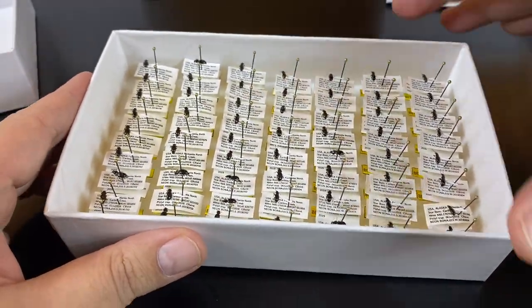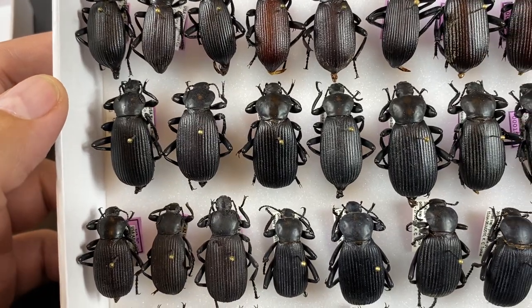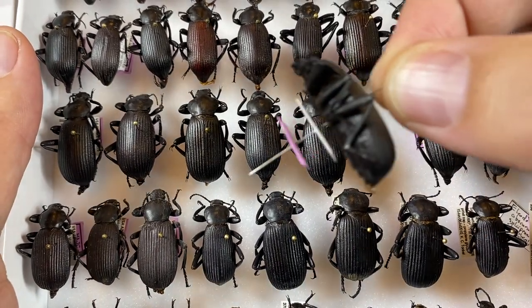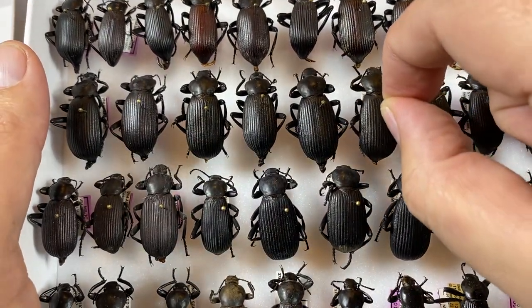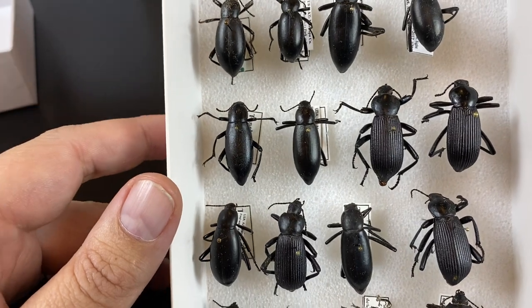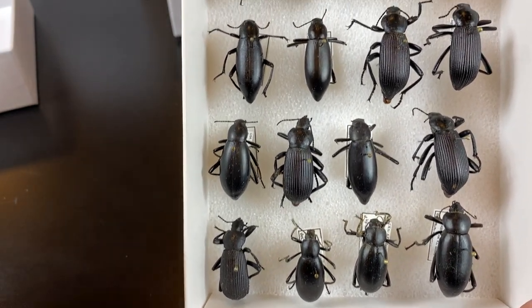We can also think about presentation. This is perhaps the least important aspect of our collections, but it's nice to have something that looks good. Here's an example from my own collection — these are darkling beetles — and you can see they're all nice, neat, and uniform. Their legs and antennae are mostly tucked up under their body, so you can get them close to each other without ripping anything off; all of those tarsi are actually tucked up underneath for protection. There is a preservation element there as well, and it looks professional, which psychologically shows value. This example from our teaching collection at Arizona State University has maybe less attention given to the specimens, giving a very different look — though this is much less important than scientific usefulness and long-term preservation.